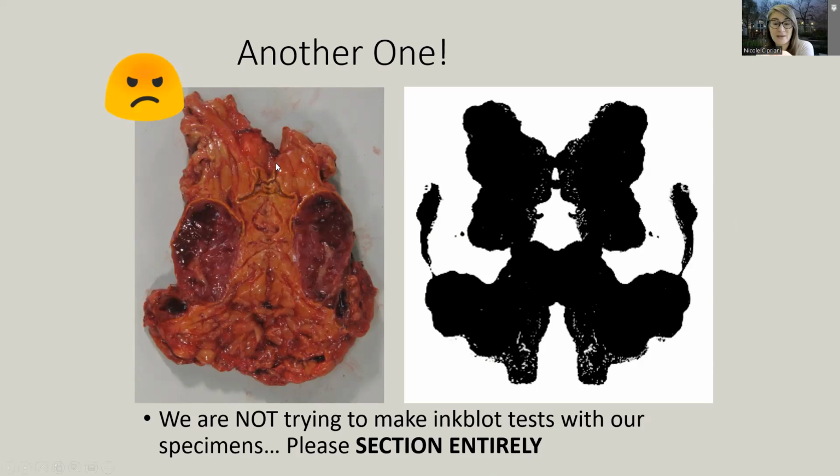You lose information here in the crevice. You can actually see that there's an adrenal gland right on top of this mass, and you haven't fully sectioned through the adrenal gland. So what else is in there? I don't know. It's hiding, right? Cut through it. It's fine.